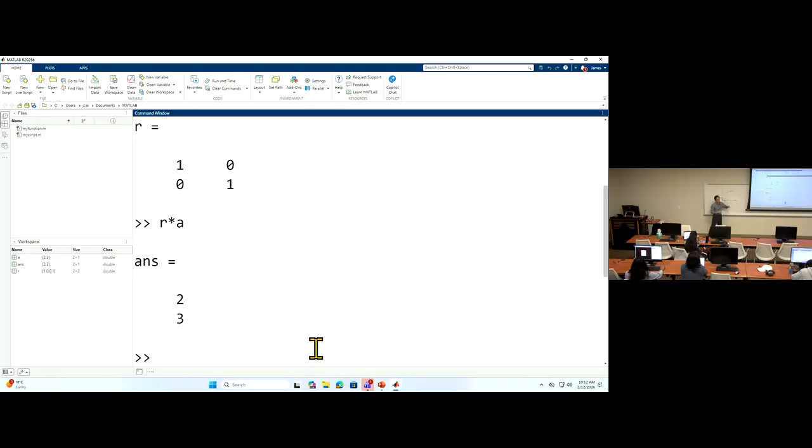How can you normalize B? If I decide to use B as my new x-axis, B has to be normalized by its length.